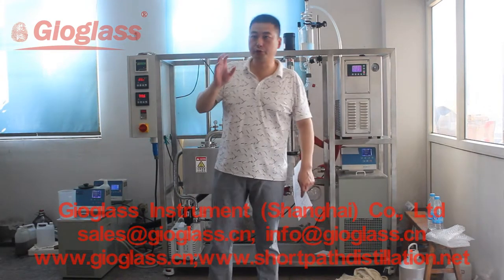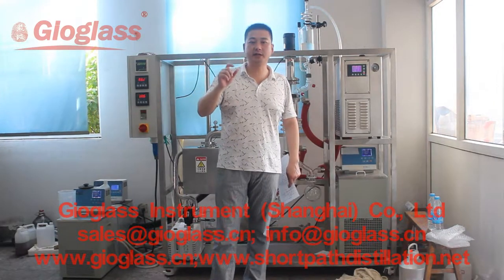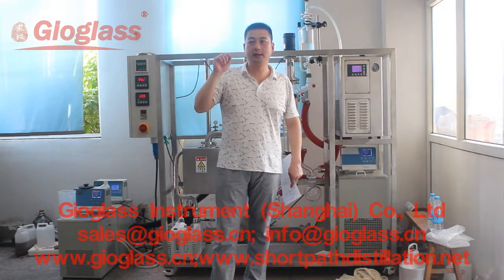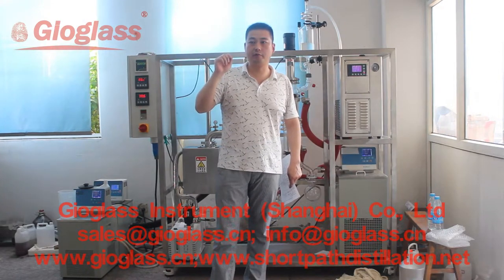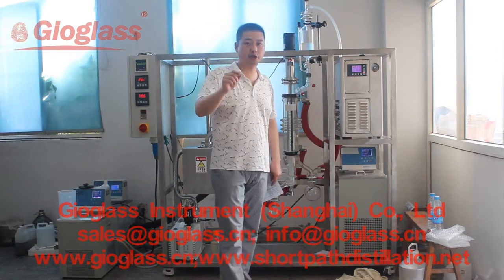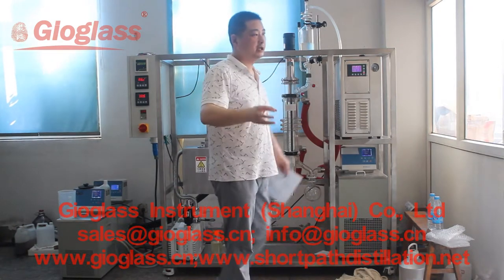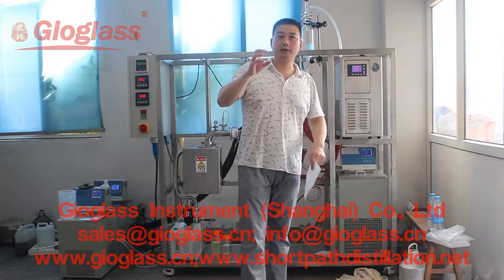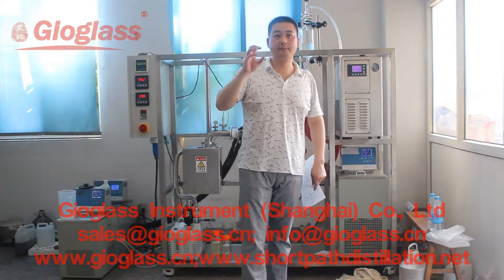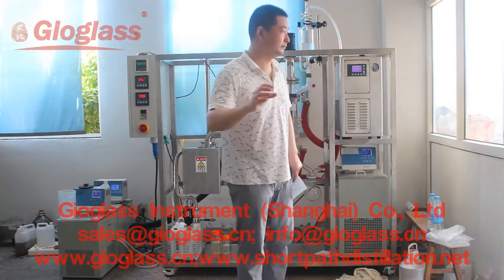Today we're going to do a trial in our lab for the coconut oil. This is our second fractionation trial, and we will raise the heating temperature to see if we can get 35% of the total feeding material.